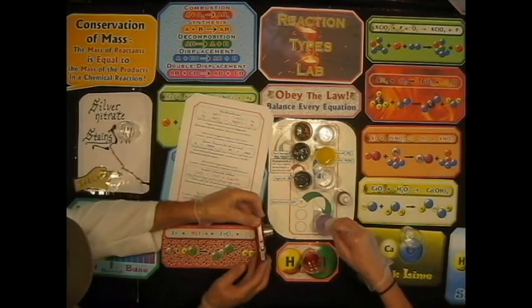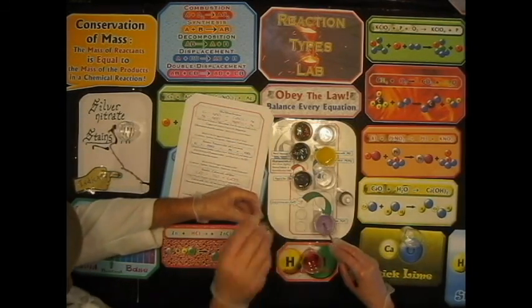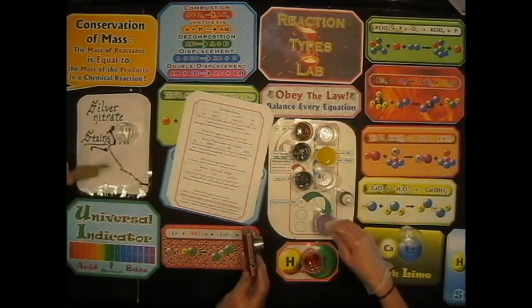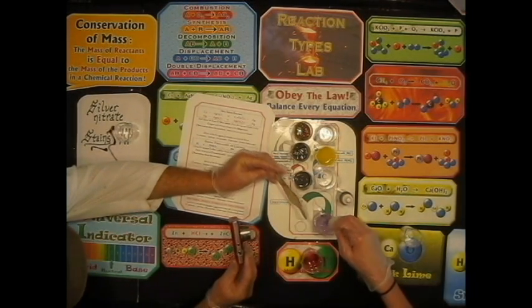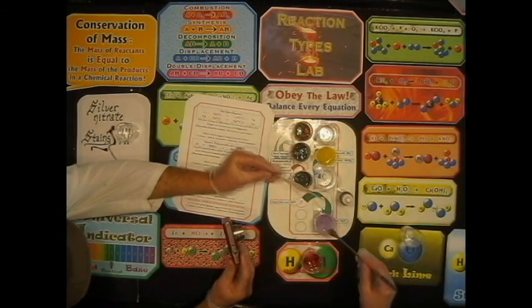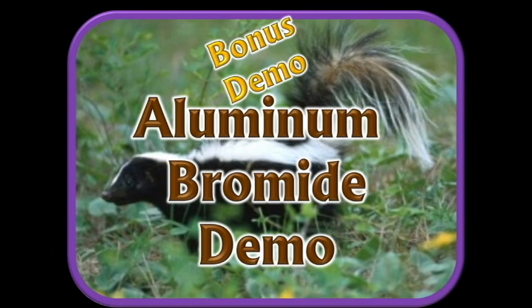So what does purple indicate? It's a base. Purple indicates that it's a base. Now remember, this is called an indicator because the original indicator is your index finger, so it's indicating that it's a base.